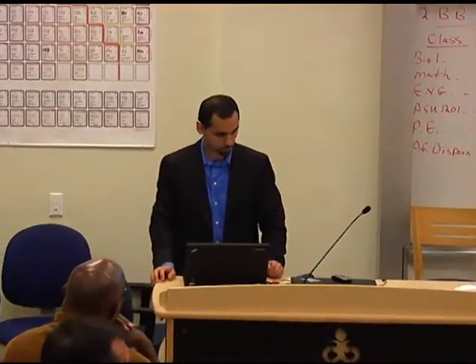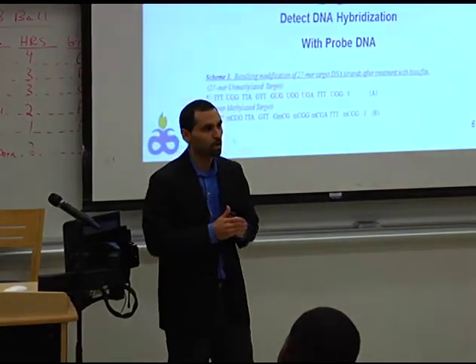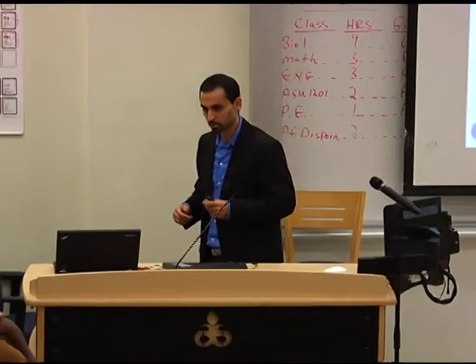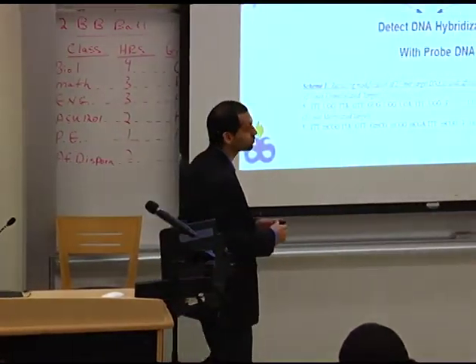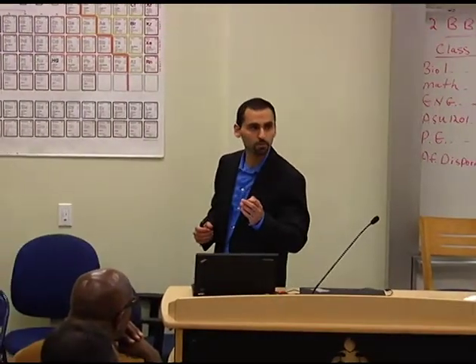I'm curious because DNA is not supposed to have uracil, not to come from some RNA messenger or something. DNA does not have uracil, yeah, you're right. But remember, this is a chemical conversion. You're treating your DNA with various chemicals, and it's actually organic synthesis, you're converting your cytosine to a variation of a different base, in this case the uracil. But you're right, uracil is not in DNA, and that's why it works here, because now that uracil will not bind to guanine. It's not complementary. So we've made the unmethylated DNA non-complementary through this treatment.